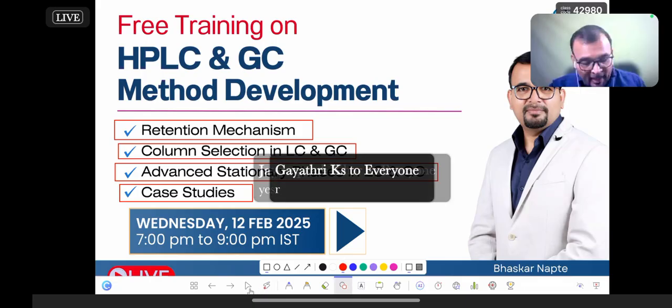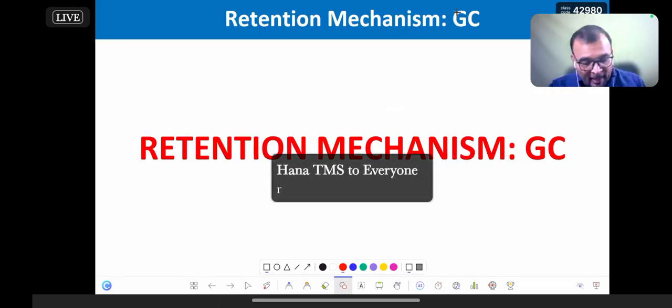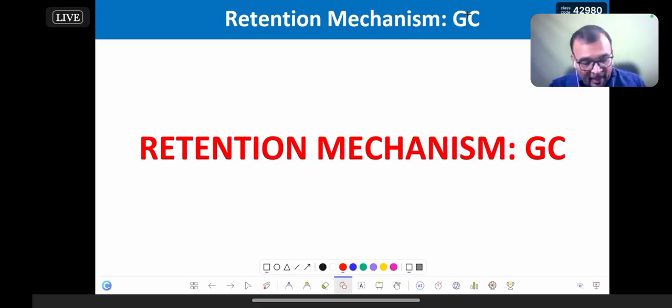See, first and foremost, we will start our discussion by understanding the retention mechanisms in case of gas chromatography. Then we'll discuss retention mechanism in liquid chromatography. So here are the important points when you talk about gas chromatography.